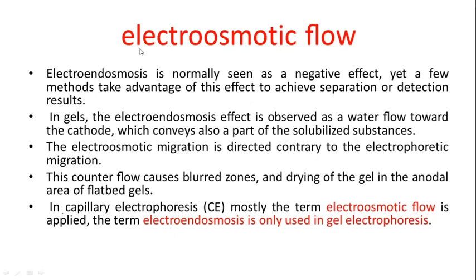Okay, next we move on to electroosmotic flow. This is an interesting terminology we use when we are running capillary electrophoresis. Capillary electrophoresis is a very famous electrophoresis. If you are running capillary electrophoresis, we call this electroosmotic flow. If we are doing gel electrophoresis, we call it electroendosmosis. Both are the same process.